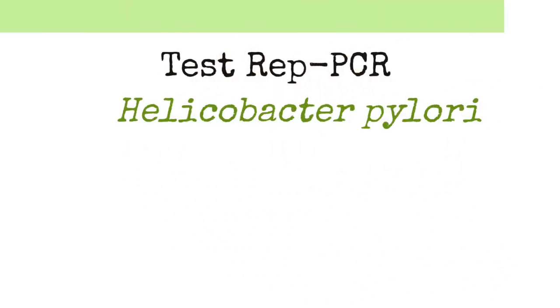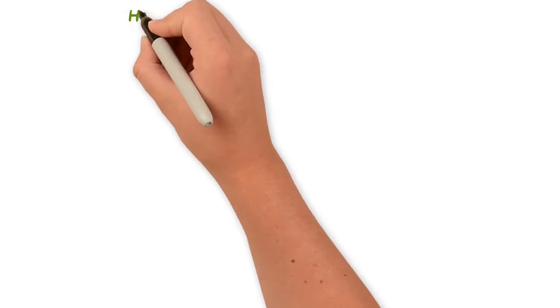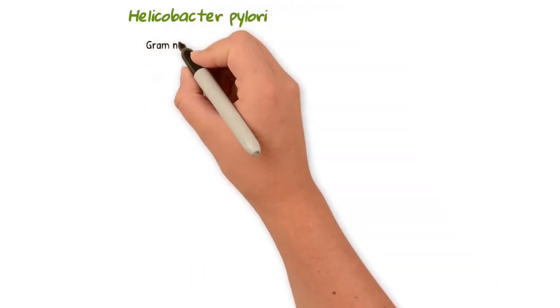Hi, in today's video we are going to talk about Helicobacter pylori and the application of the Rep-PCR test for its genotyping. As a first glance, we will review basic information about the bacteria, starting by its microscopic characteristics.